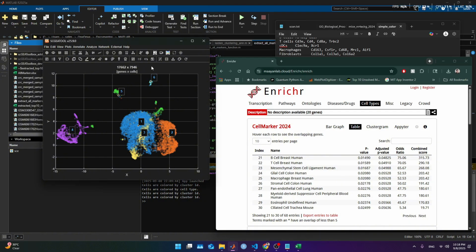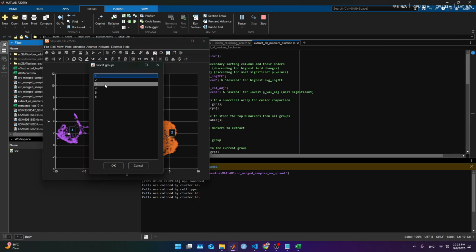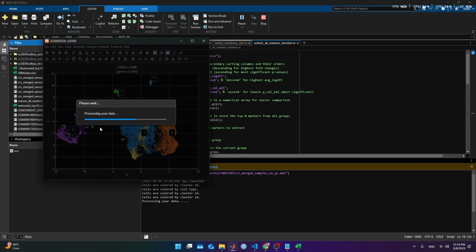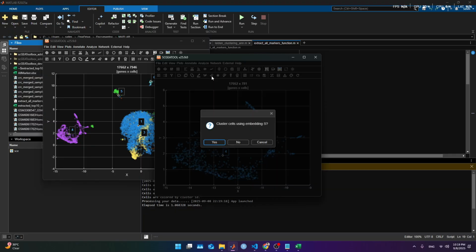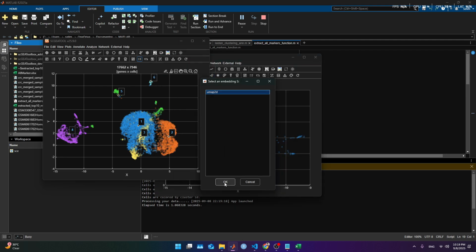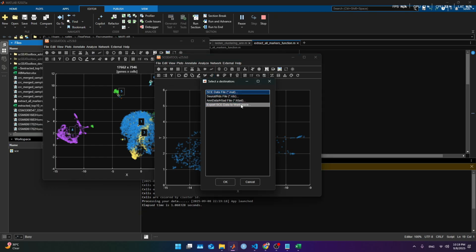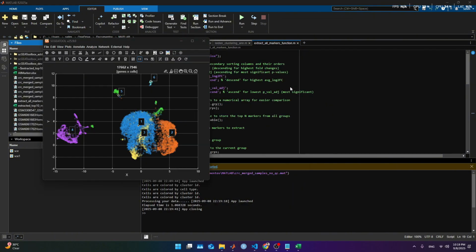And the trick we have to do here is to select that cluster and subsample. So we are gonna hit here and select by class, cluster ID, okay, alphabetic is fine. I'm gonna grab the number 4 and proceed with the selection, and it's gonna bring it on here. So here, what I can do is do the clusters again. I'm gonna store it. So this is gonna be now the SCE1. I can close it.